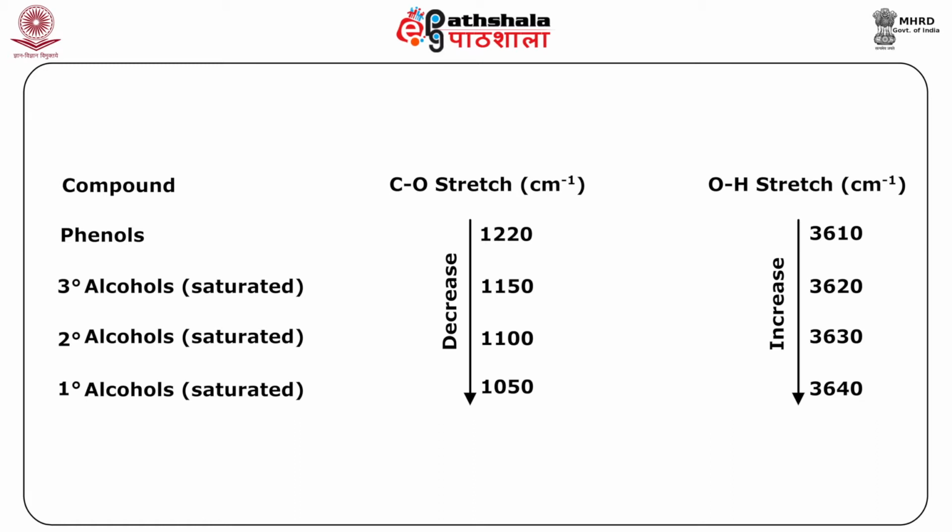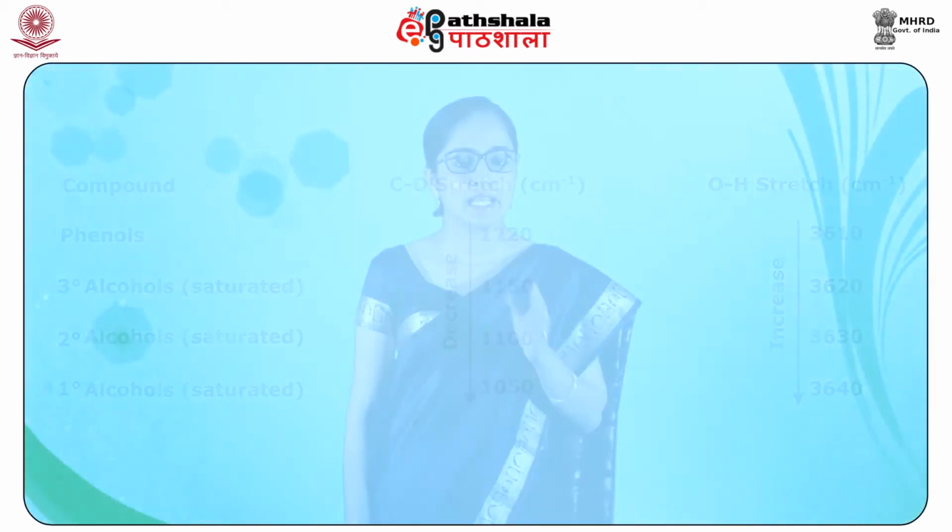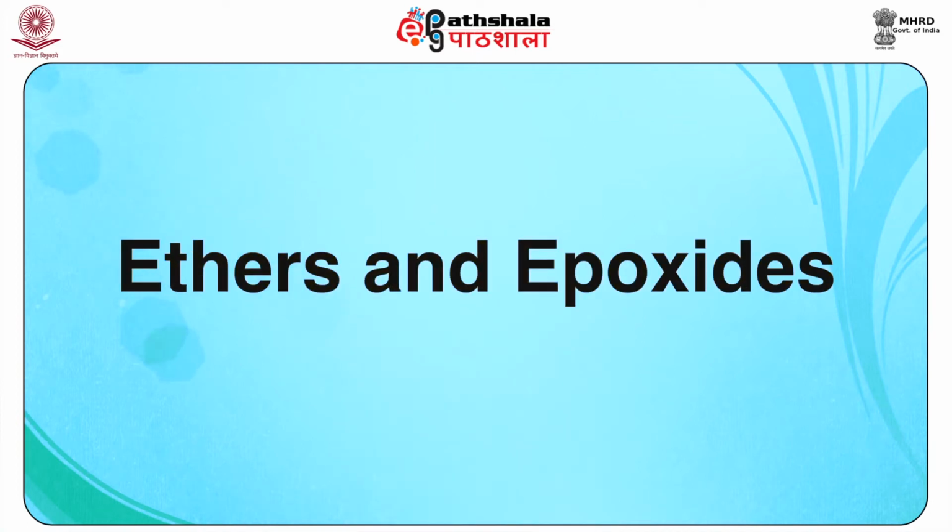Now, these compounds also produce O-H bending vibrations, but the latter couple with other vibrations and produce complex bands in the fingerprint region. Now, as I told you, all this has been completely listed in the table, as you can see. Now, we come on to another functional group, students, that is ethers and epoxides.